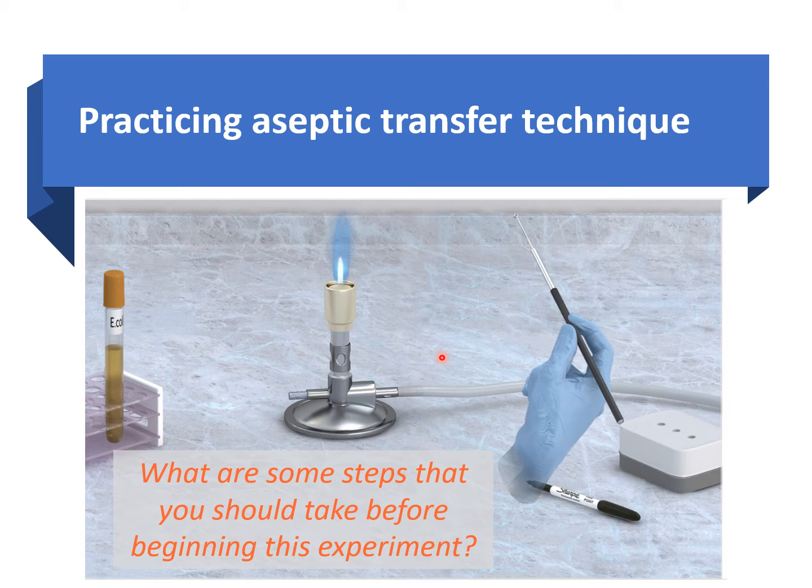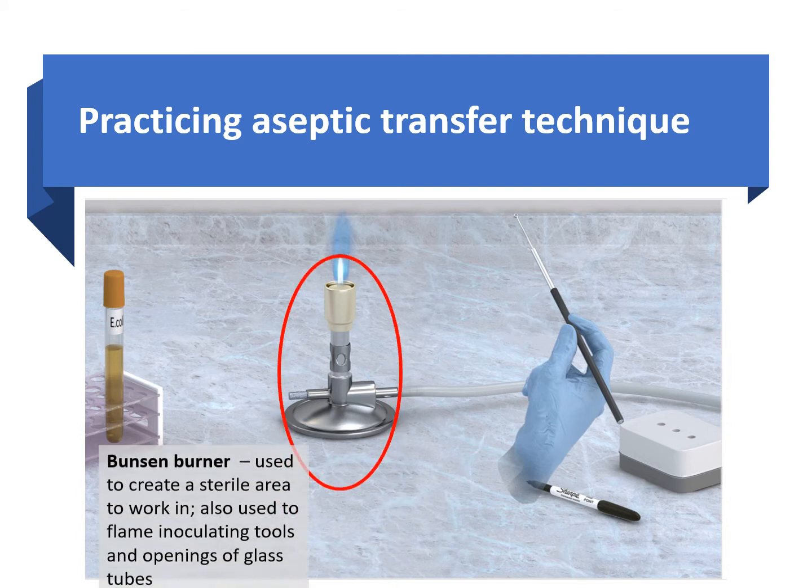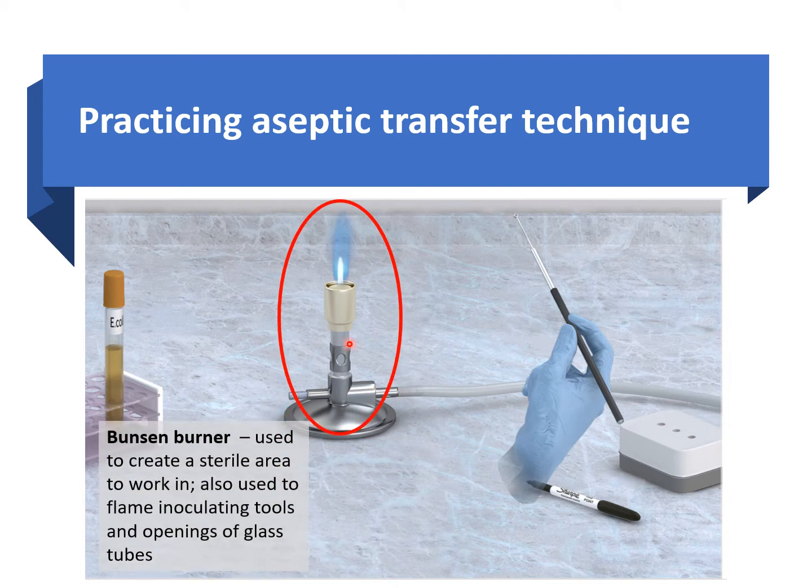Okay. Go ahead and create that sterilized zone with your Bunsen burner. As we said, the Bunsen burner is basically used to create that sterile zone.